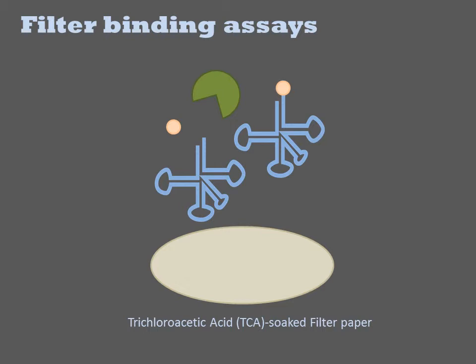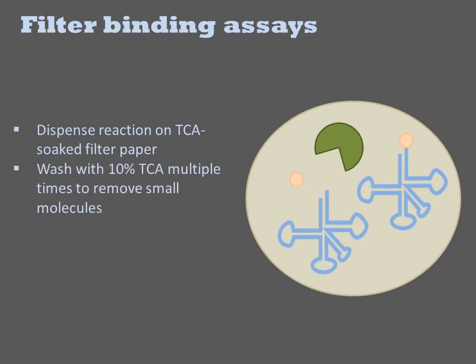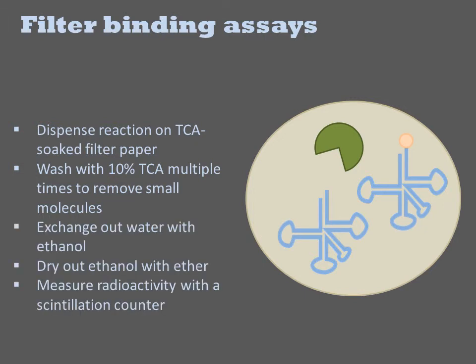After incubation, we transfer the reaction to a piece of filter paper that has been soaked in trichloroacetic acid and then dried out. The acidity will quickly denature the sample and cause the tRNA and protein to precipitate in the paper. So now the reaction is quenched and all the molecules are in the paper. We then soak the filters in 10% TCA. Unreacted hot tyrosine diffuses out of the paper, but the proteins and tRNAs stay behind. After several washes, we soak the paper in ethanol to remove water, then dry it out fully with ether. We then place the filter in a vial and quantify the radioactivity with a scintillation counter. We can then calculate how much of the hot tyrosine remains on the filter, and from this quantify the conversion during the reaction.